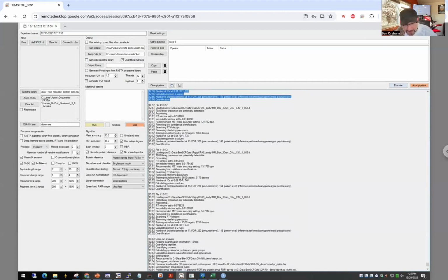And if you take these same 12 cells and you run them and you generate the library, you may be looking at 6 to 8 hours on a 16-core computer like this. Obviously much faster on a better computer than this. I should note, right, I am using ultra fast because I'm realistically using DIANN for QC on this actual computer in the lab. But you probably do want to run this for optimal results, so that you're actually getting a deeper profile on each single cell.